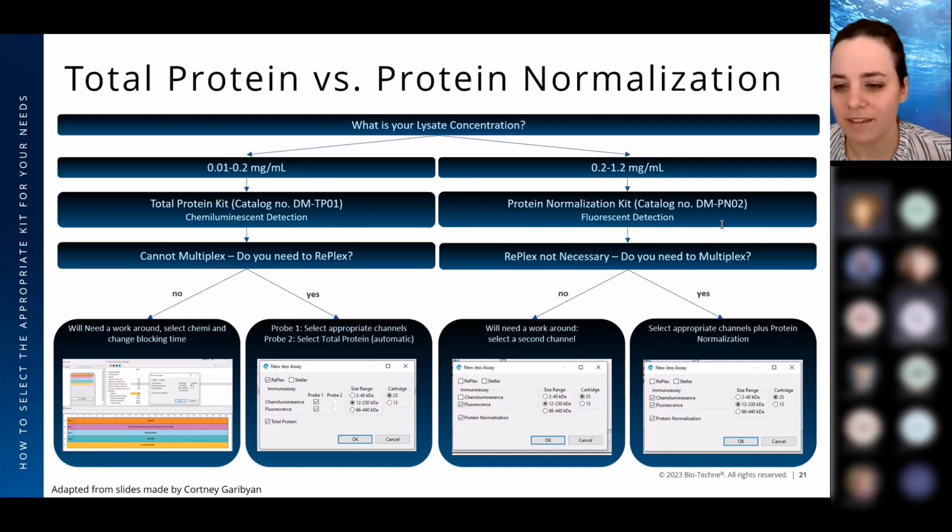Hello. Yeah, so whenever we do the protein normalization, we see our target protein peaks. The protein normalization peaks are just a little bit shifted towards the higher molecular weight, but the same size of the peaks, as if they're repeating the same peaks of our target proteins. And whenever we do the same lysates with a different target protein, sometimes those peaks are repeating those target proteins or don't repeat at all.